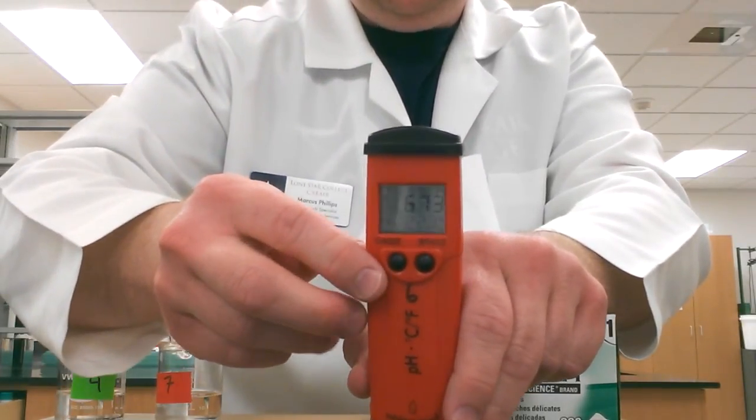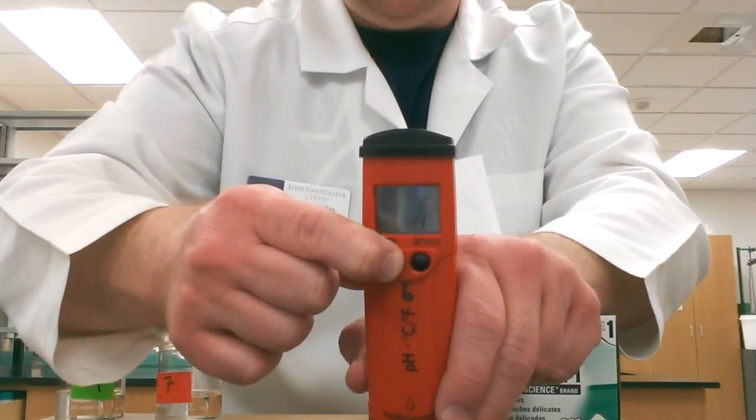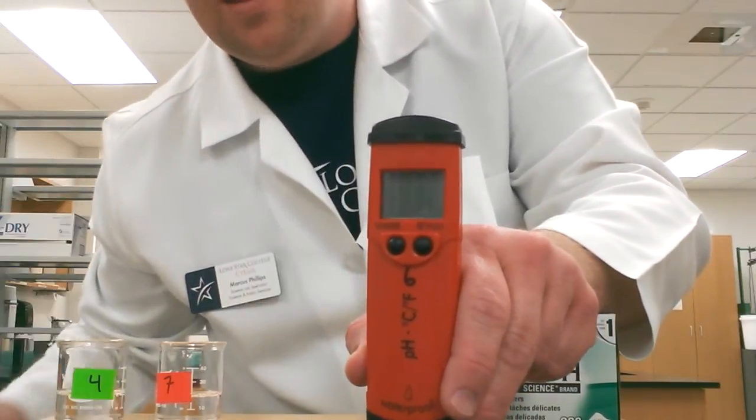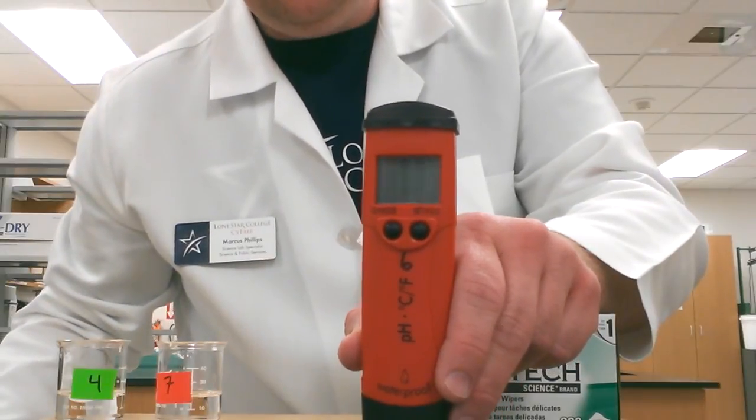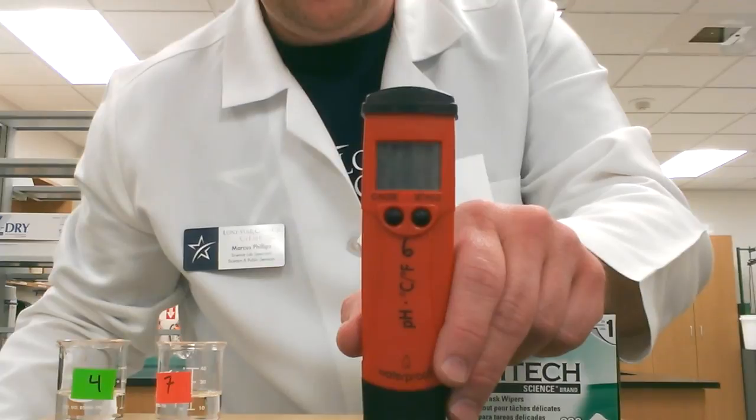And I'm not going to be using this, so I'm going to go ahead and turn this off by holding down the power button one more time. And now it's turned off. So, now you know how to calibrate this new handheld pH meter by Hanna Instruments.